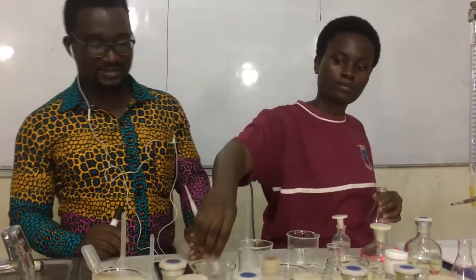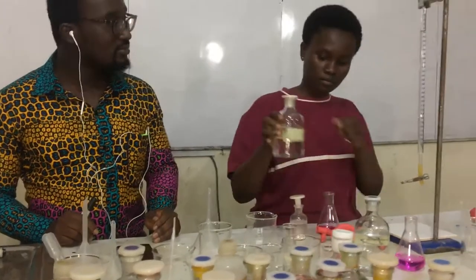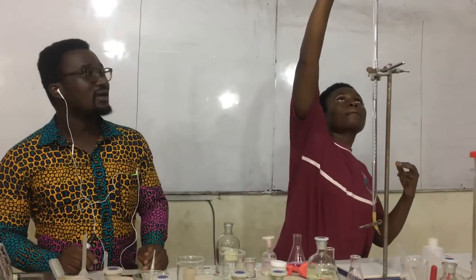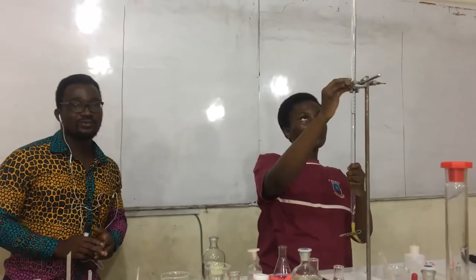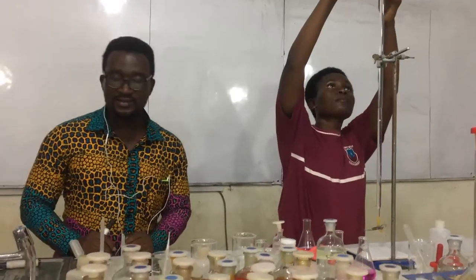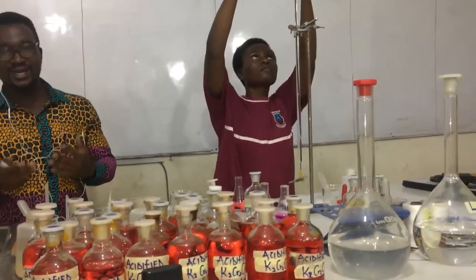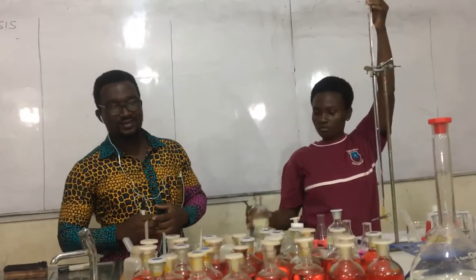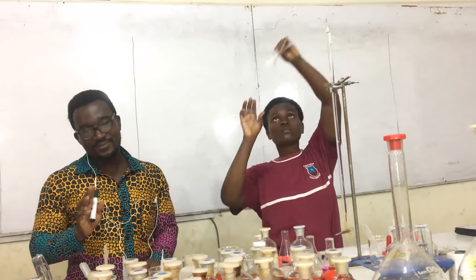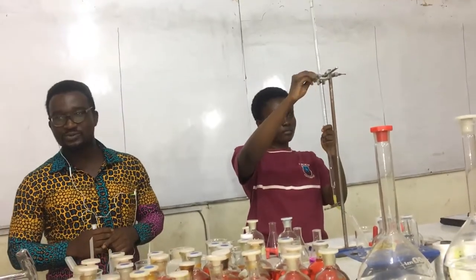Okay, so she has added a few drops of the indicator. You see how she is comfortable handling the various apparatus. That is how you are supposed to act when you are in the examination hall. My WASSCE candidates who will be writing, don't panic. Just relax and then do what you are supposed to do.